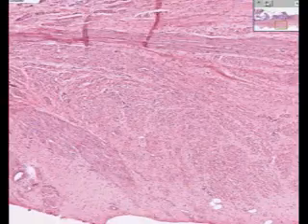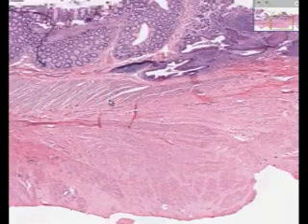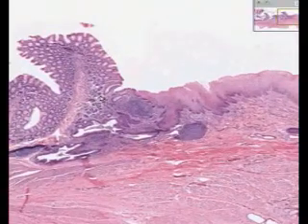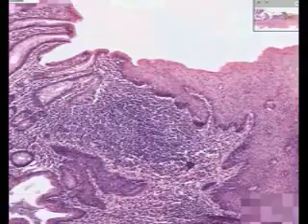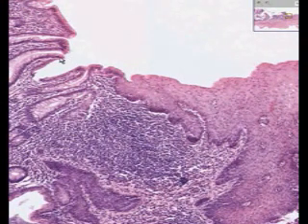This is a squamo-columnar junction of the rectum and anus. The precise location is also called the pectinate line. Notice you could actually boil down the actual area to a single cell because you know all of these are your columnar cells of the rectum and your squamous cells of the anus.